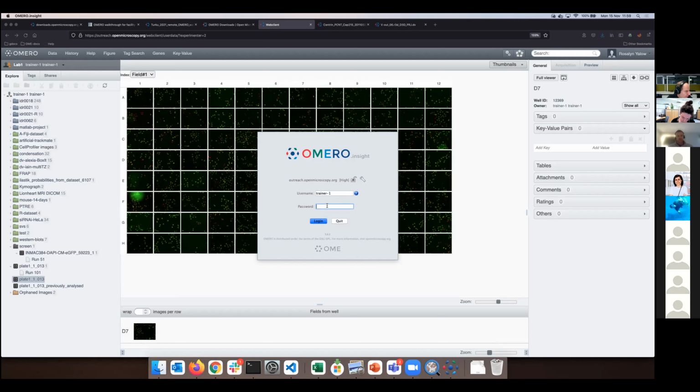So in a clever way, you create a new targeted group for purpose X and put in only the people who have the right to do this and that, who are allowed to see the data in that group or not. Both people and data are inside groups, so you have to be careful there. You don't want person X to be in group A and the data in group B. That would not work.